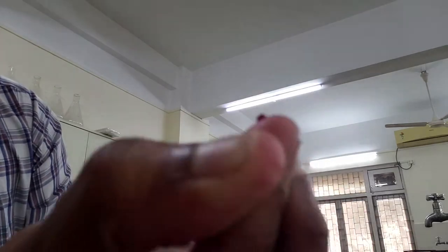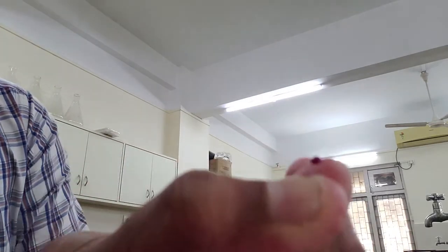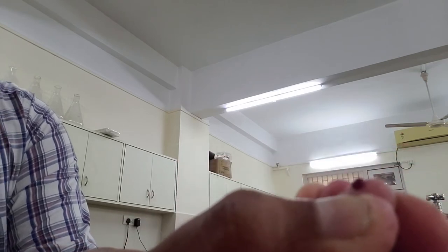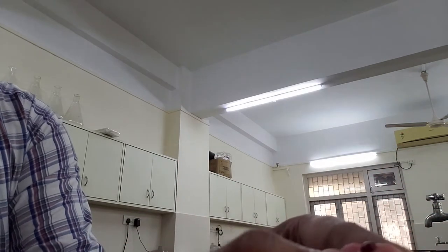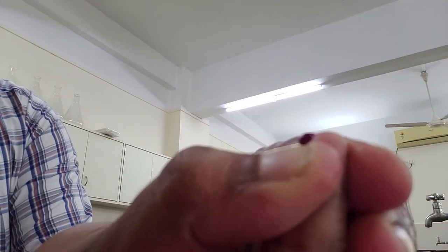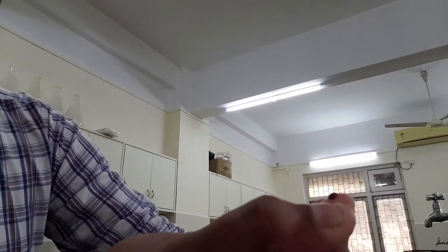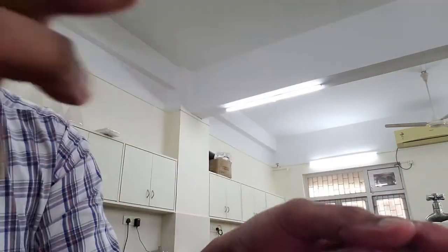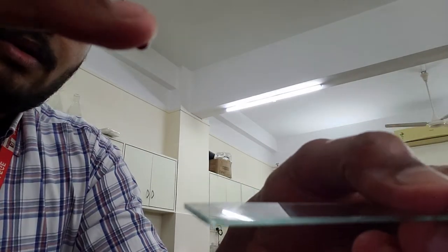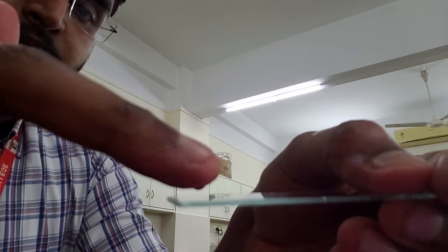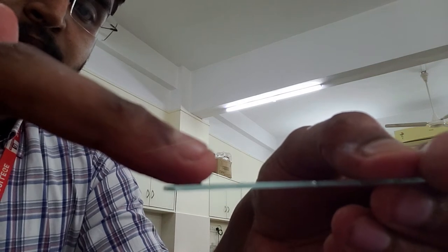You can see probably that there is blood oozing out from my finger right now. I'm just going to apply a little more pressure so that I get more blood, and I am going to put it onto the slide. This is the slide on which I will be placing a drop of blood.